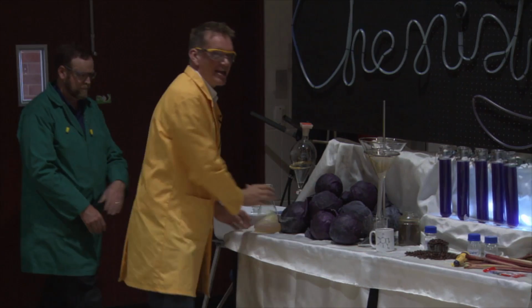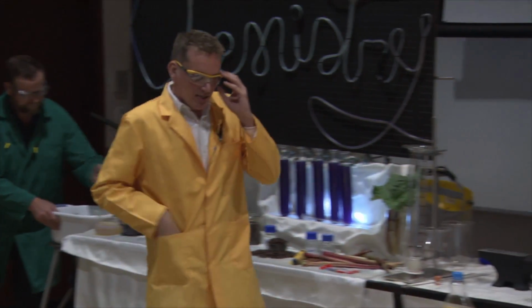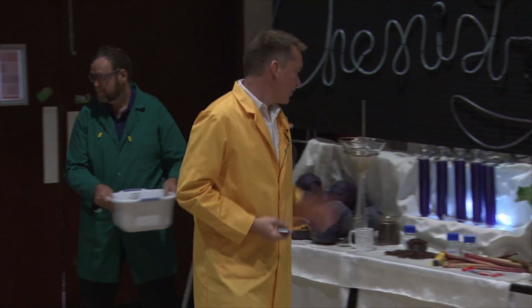Look at that, chemiluminescence. So this is light from chemistry, and all of this from the ingredients that you can find in coffee. Amazing. So, lots of chemicals there.